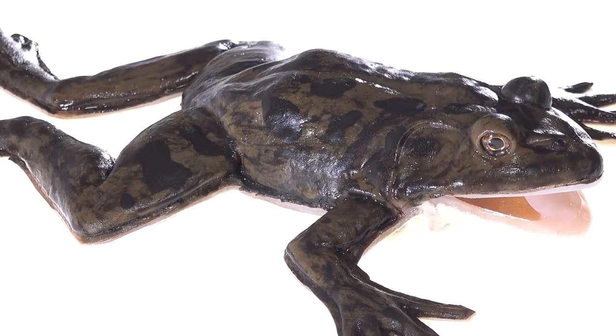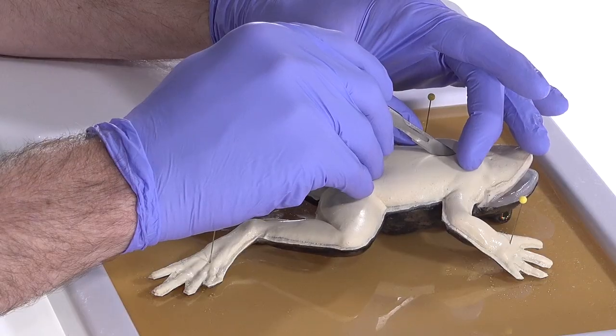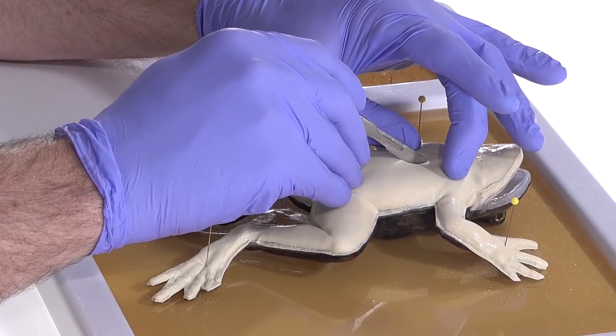SYNFROG is exactly what it sounds like — it's a synthetic frog. It's made of water, fibers, and salts. It's a complete animal. It's got a complete skeleton, musculature, thoracic organs, vasculature, and abdominal organs.